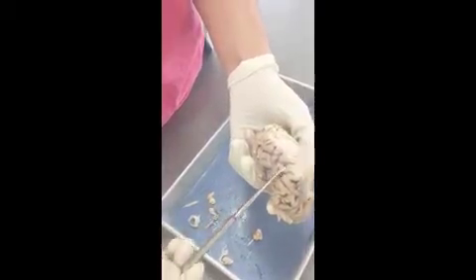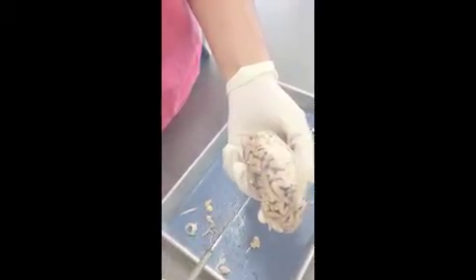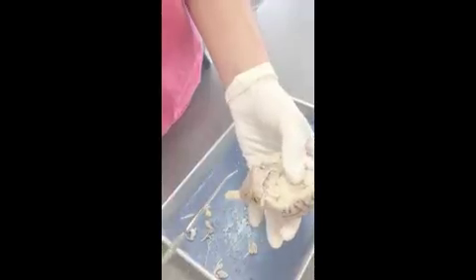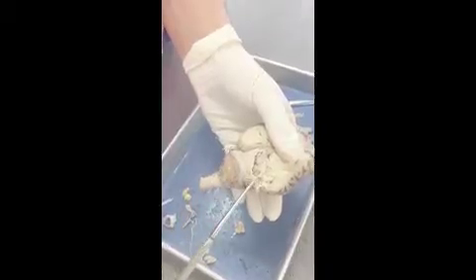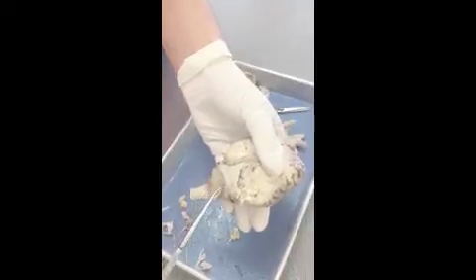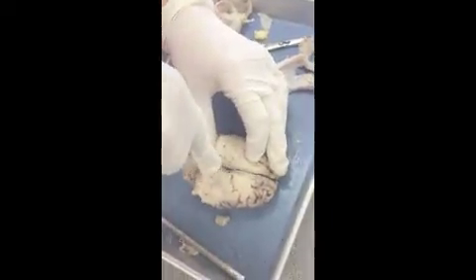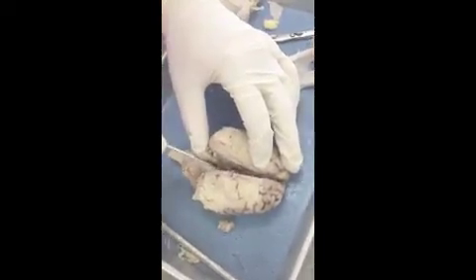Here is the temporal lobe, which controls auditory, memory, and speech. And then back here is the occipital lobe, which controls visual processing. Altogether, these four lobes create the cerebral cortex. Now we are going to make a mid-sagittal cut down the center of the membrane, right through the longitudinal fissure, which separates the left and right hemispheres.